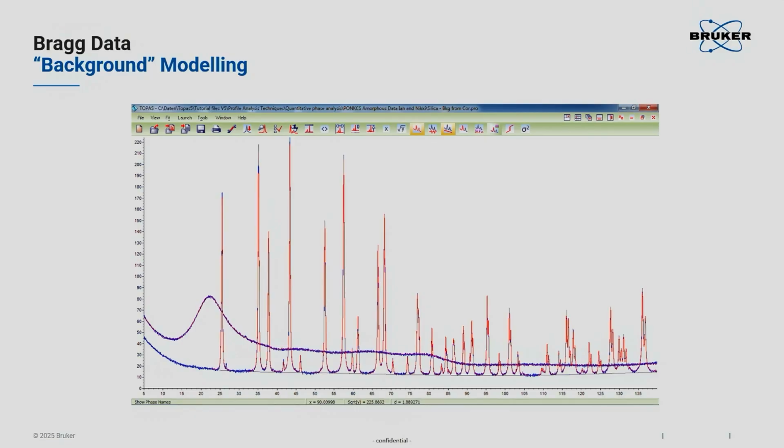And if we can assume that the shape is well defined over the whole angular range, then of course we can get a very good estimate of the instrument background in this case. If we have fluorescence, forget it. It becomes increasingly difficult. But this is copper and corundum. Fluorescence is not an issue here. Also, the standards from this are sufficiently crystalline. So what I refined here as the instrument background is reasonably good.